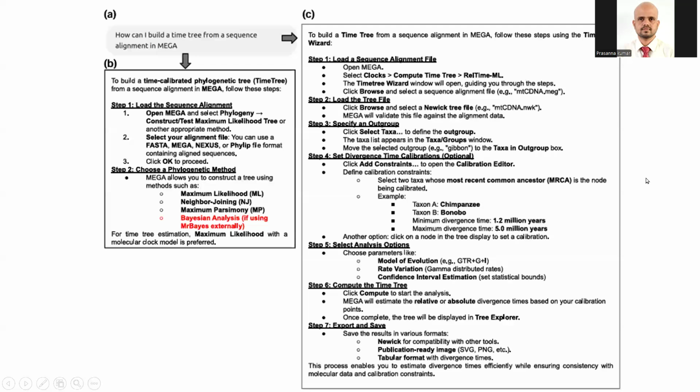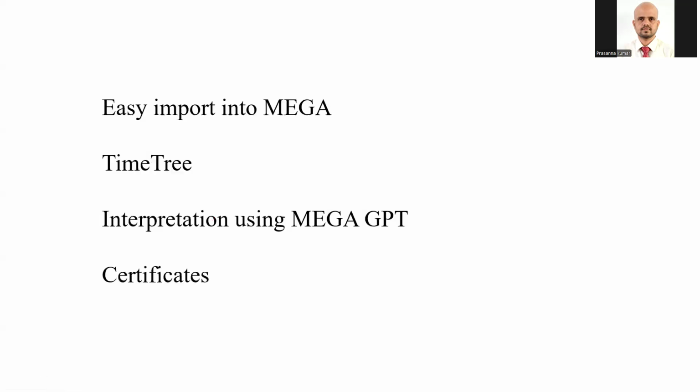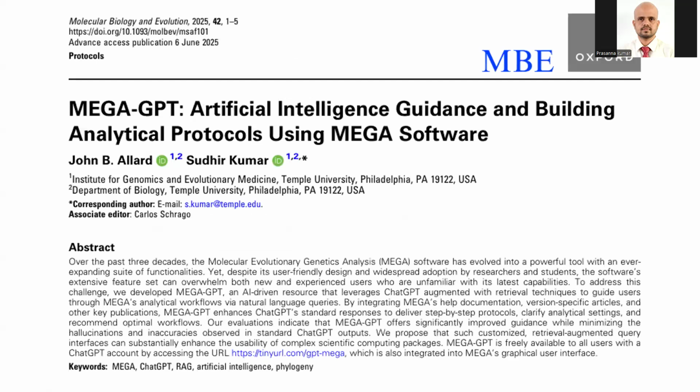Okay. So today marks the last day of our AI integrated course. I want to thank you guys from the bottom of my heart for giving us this opportunity to share whatever little we know about this MEGA integrated generative pre-trained model. It has been published just this year. Whoever is doing any kind of DNA sequence analysis, I would strongly recommend incorporating this paper. If you want to read more about this AI inference, I recommend this paper, which gives you much more perspective, and do cite this paper.